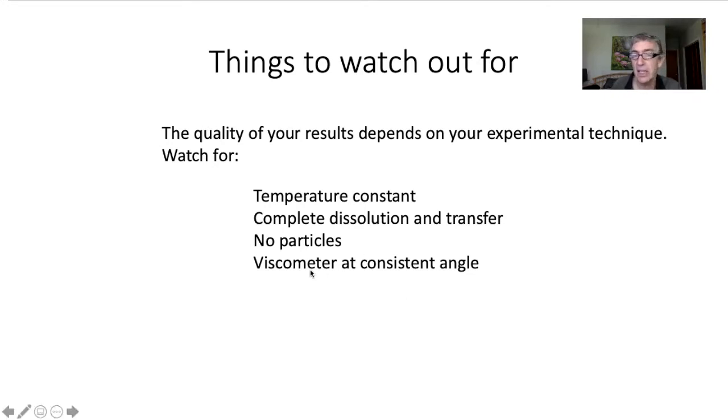And lastly, you'll want to be sure that your viscometer is always set up so that it's at the same angle, because the time it takes your solution to pass between those 2 fiducial marks will be dependent on the angle of the bore. So it needs to always be at the same angle. So that concludes the theoretical introduction to this experiment.